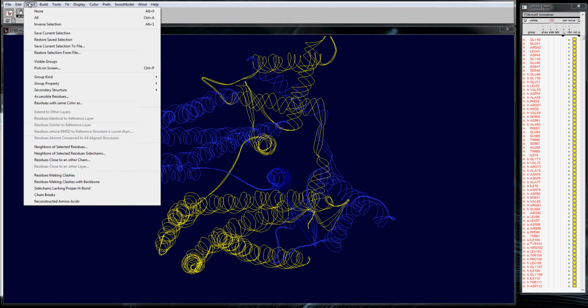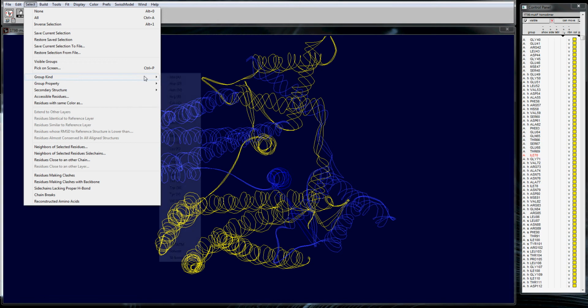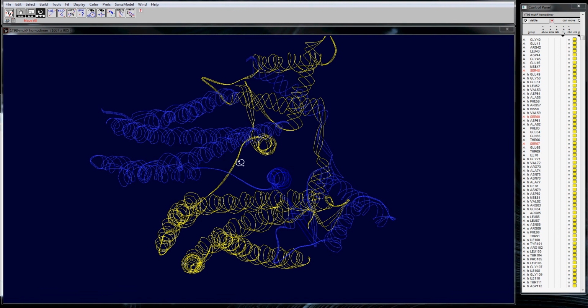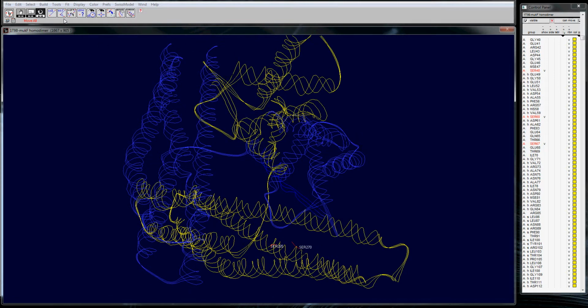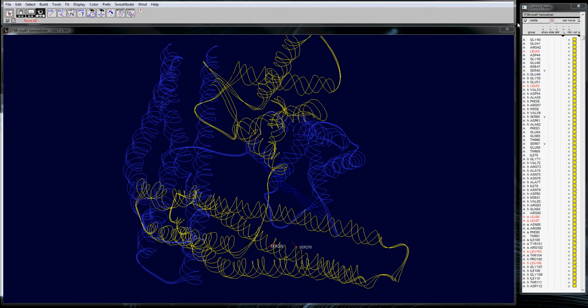I'm just going to select by kind, how about serine? I don't know, this is something random. And we're going to show, there's a couple serines. I guess I was looking for something more centrally located. So I don't like serine actually, so serine's no good. Select by kind, how about leucine?